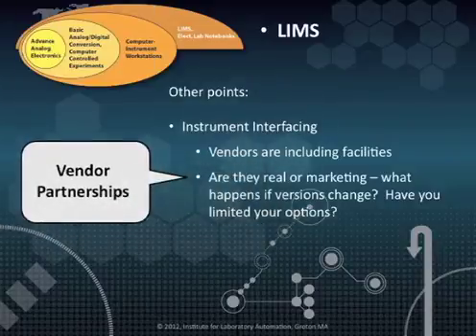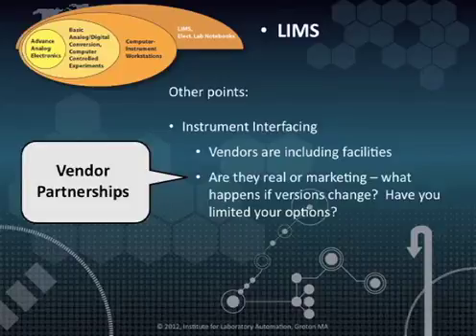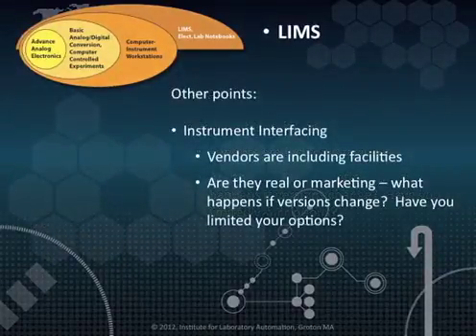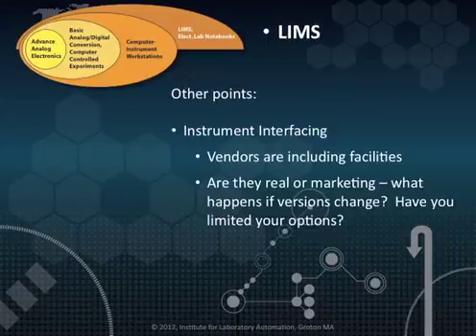Often there are announcements of partnerships between various vendors to solve these types of problems. One vendor's instrument management system may be paired with another vendor's database system. One thing to look at is whether or not these pairings are done for marketing purposes or if they are built upon a solid technical basis. Marketing partnerships come and go, but if you're purchasing a product based on these partnerships, you'll have to live with it.